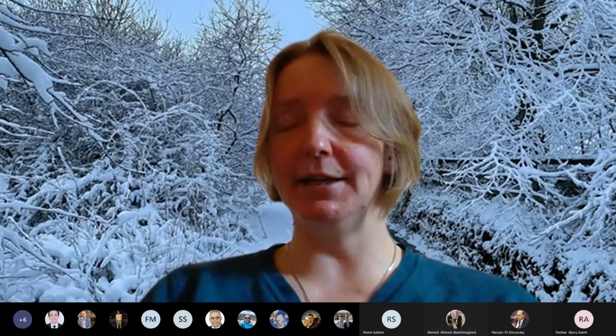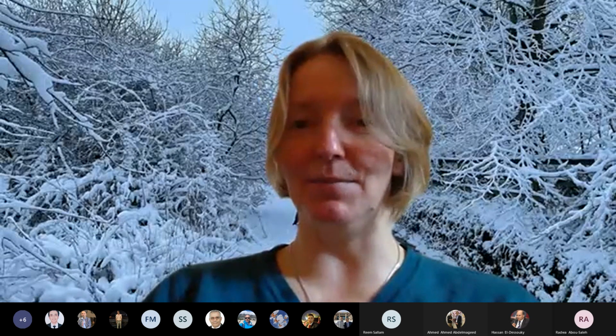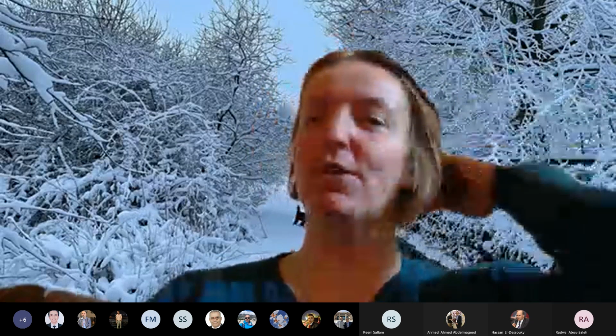What you tend to need, and this is probably a limitation, is that the formation of these droplets happens so quickly that whatever you're using to stabilize that interface needs to diffuse very quickly, to be able to coat the droplet as it's being formed. If you have something with very low diffusivity, you might get problems where your droplet is not quite coated in time before it leaves the device. But that's the only thing. Otherwise, people do use nanoparticles as well.